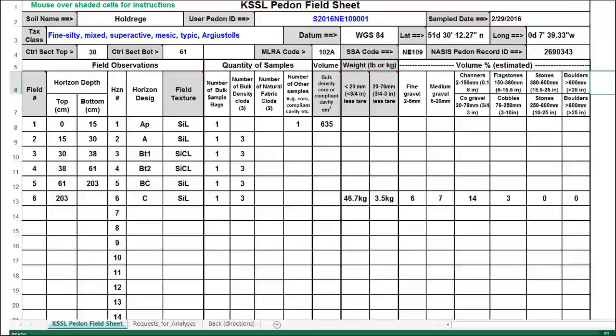The sequence number, I might have referenced that when I was labeling the bulk density box. But the sequence number within a pedon would be the horizon number on that pedon sheet, 1, 2, 3, 4, 5, and 6. That's the way we label. We put sequence numbers within a pedon for every horizon. But for the clod box, they're going to number the corresponding number on that lid with the horizon and the depth, so they can get that all in there. Yeah. Yep.